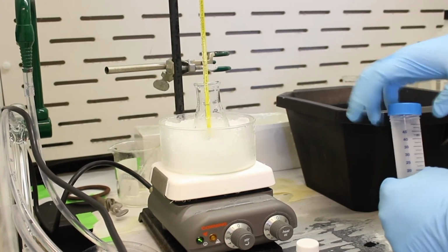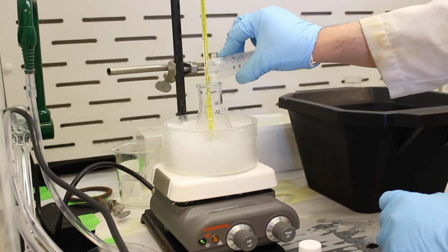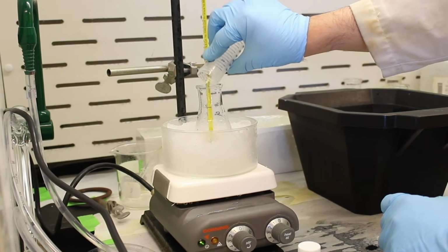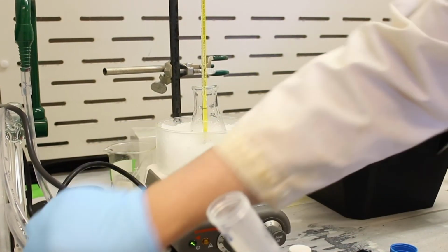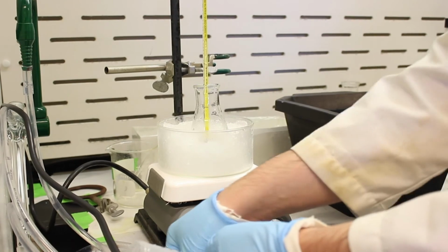So to do the reaction, it's very simple. You just take your sulfuric acid. We're going to add it all to our reaction flask. By the way, this sulfuric acid is very corrosive. So I'll take a piece of paper from our thing here.